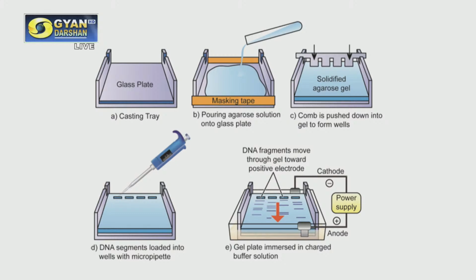So the same principle also holds true for restriction enzyme digestion. So you cut the DNA, as I said, and then you load the DNA in the agarose gel and you visualize whether the digestion is successful or not. Either you may get a single band, that is linear band, or you may get 2 bands or 3 bands depending on whether a fragment of a particular size has been released from the plasmid or not. So that is the total experiment for the restriction enzyme digestion followed by agarose gel electrophoresis.